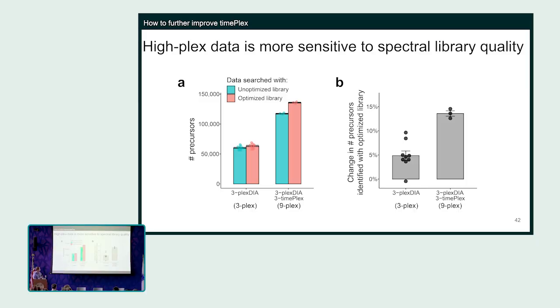Okay, so this is more about future avenues, which I'll keep relatively brief. The reason I was saying that we think the coverage can improve is, to me, something really intuitive. As we're using this joint modeling approach to model spectra of peptides, we have complete reliance on the library we're given. If that library is even slightly inaccurate from what we're actually observing, we could end up with lackluster results, not because the data is bad, but because our model is ill-informed.